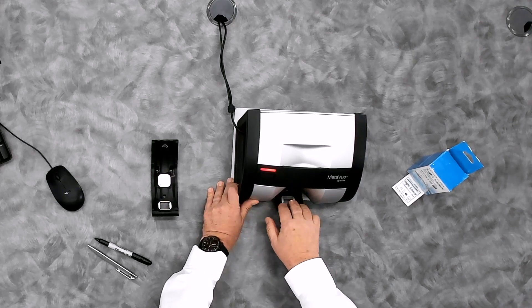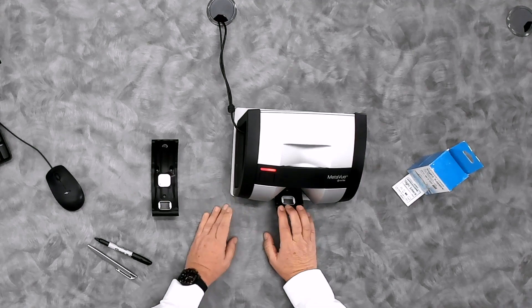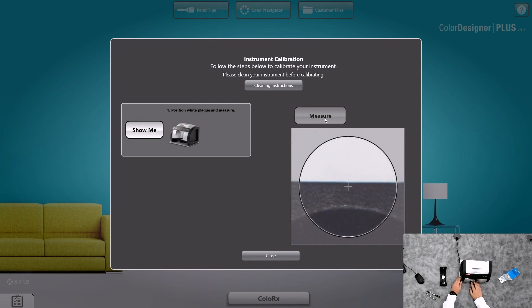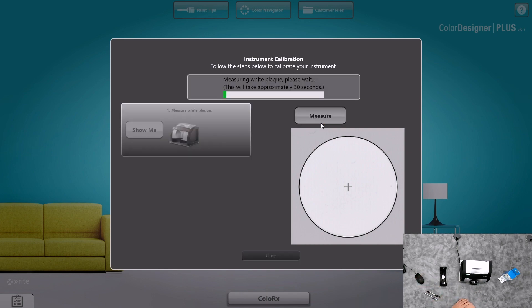You'll pull that forward. As you pull it all the way forward, the measure button on the software will illuminate. If it does not illuminate, then the calibration plaque is not in the right position. Make sure that it locks into position, then click on the measure button and the calibration will begin.